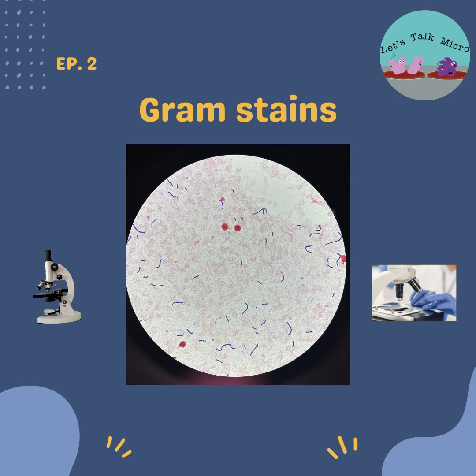And there are other types of media as well that are differential and selective for gram-negative rods. We have your Hektoen, your XLD. They are selective for gram-negative rods. Same thing, you have to be specific. You won't believe the amount of time that students or medical technologists in training, doing their practicals, their clinical rotations, can still say gram-negative, but it is gram-negative rods.